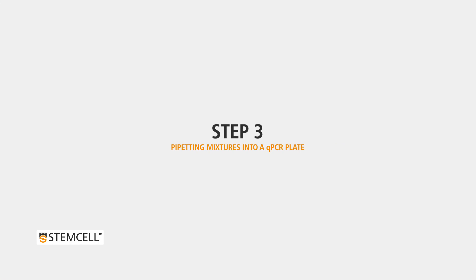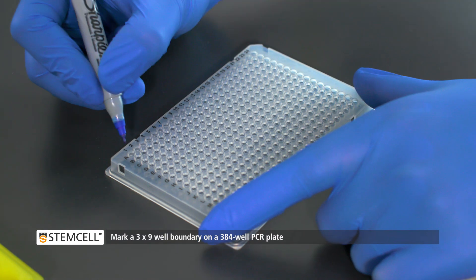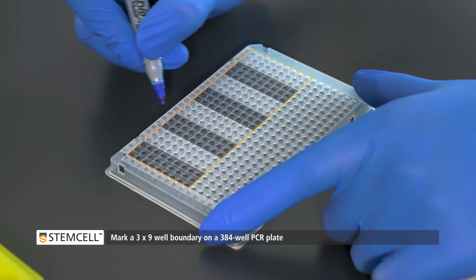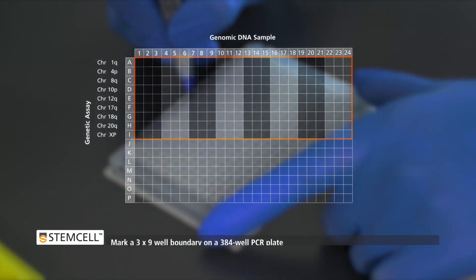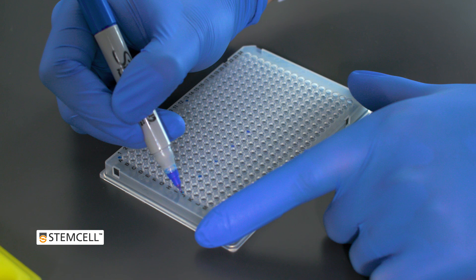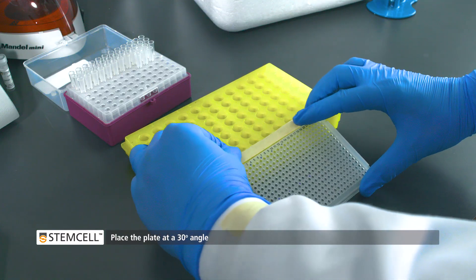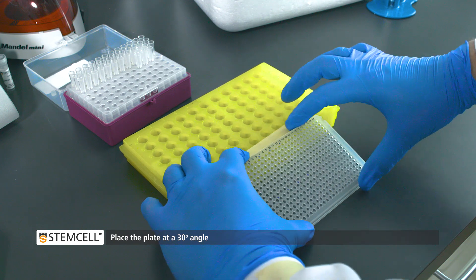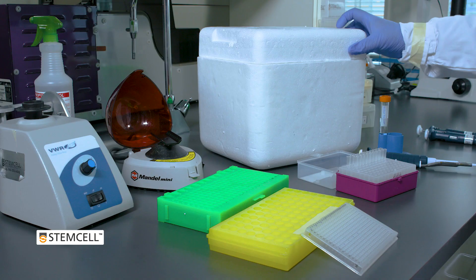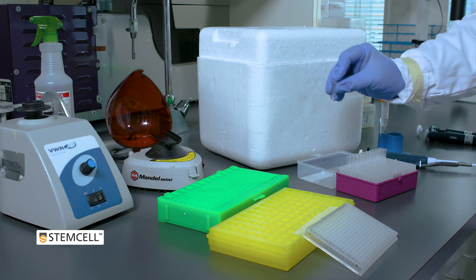Next, add the prepared mixtures into a qPCR plate. Using a felt pen, mark a 3 by 9 well boundary for each sample on a 384-well PCR plate. Angle the plate at approximately 30 degrees by taping the top edge to a microcentrifuge tube rack or something of similar nature. Take each genomic DNA sample combined with master mix prepared previously.